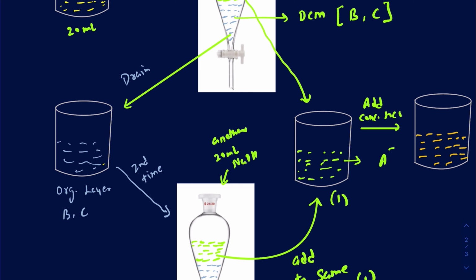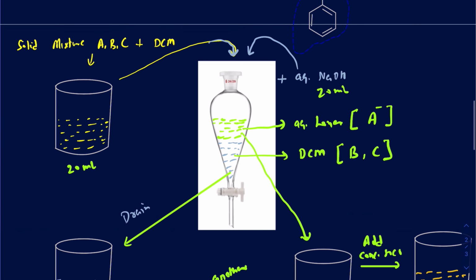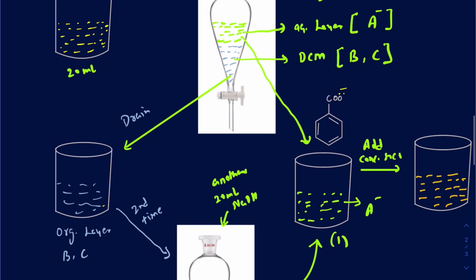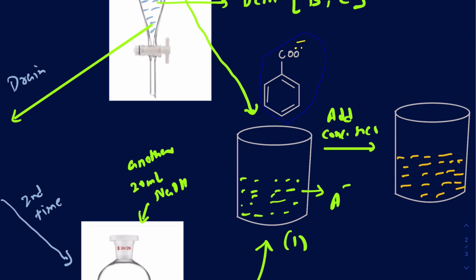Okay, so right now, what's the reaction going to happen? So you had this benzoate in there. So I'm going to go ahead back and grab this benzoate that I got earlier. So this was benzoate in there, and once you have added the HCl in there, and once this becomes acidic enough, you would have converted this benzoate into the benzoic acid here.